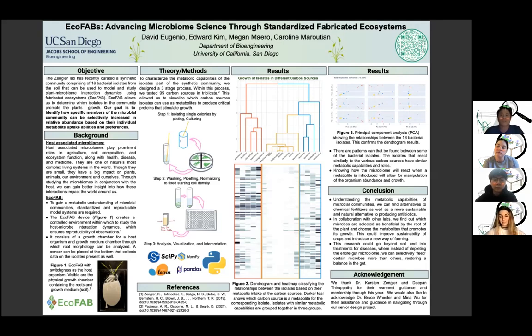With the clusters we obtained from our results, we can now look into the interactions with microbes of the same cluster. We could also look into other factors that affect growth, such as testing phosphorus and nitrogen sources. Once more data is gathered regarding these sources, our next step will be to build synthetic communities of microbes that could be used as an alternative to fertilizer. Ideally, these communities will provide similar growth factors and be resistant to abiotic stressors.